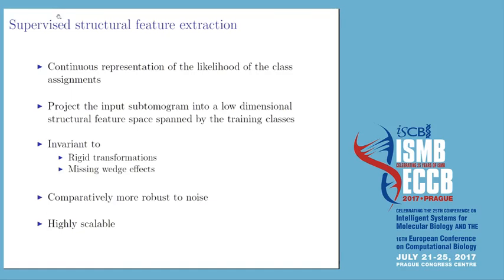Our tests show that these features are more robust to noise, and I will show you in the results section. They are also highly scalable. Specifically, once these classifiers are trained, we can extract features from a million subtomograms using a single workstation equipped with 2 GPUs, within 1 hour.